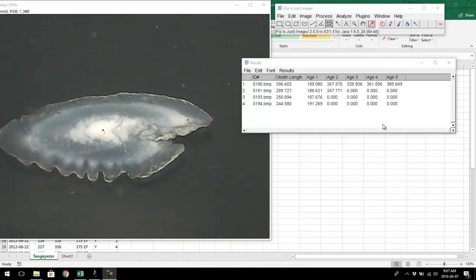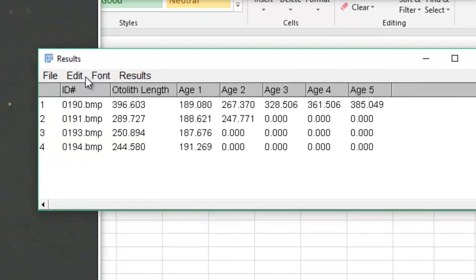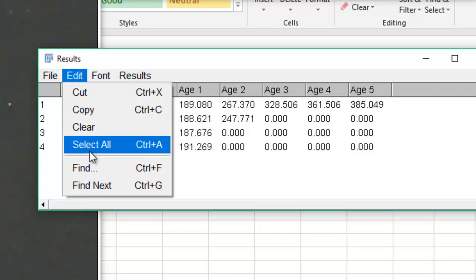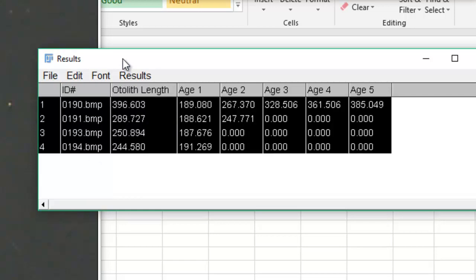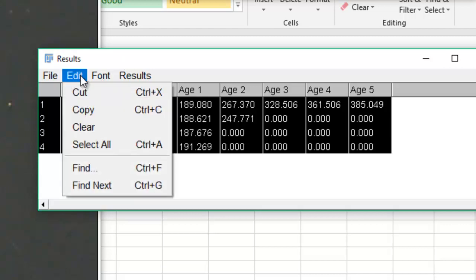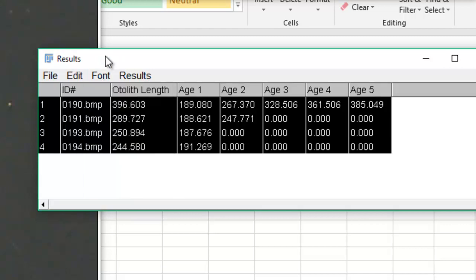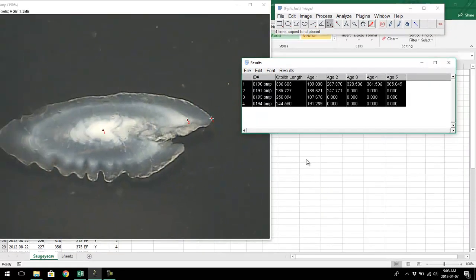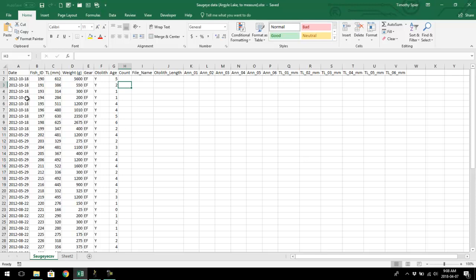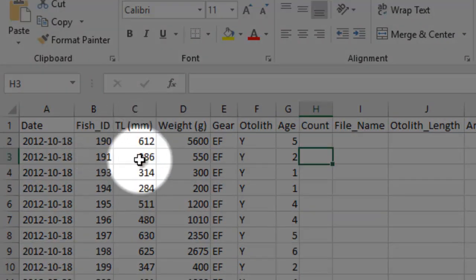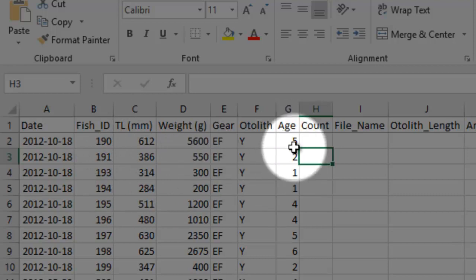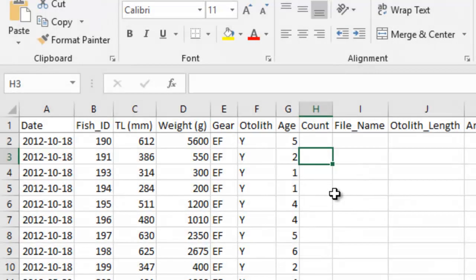Now let's talk about how to work with these values in Excel. I've measured a few otolith images and I've got all my data in the results table. I'll go Control+A to select all, then Control+C to copy. In my Excel file, I have the date, fish ID, length at capture, weight, and age. I'll use all this data plus the data from ImageJ to back calculate.